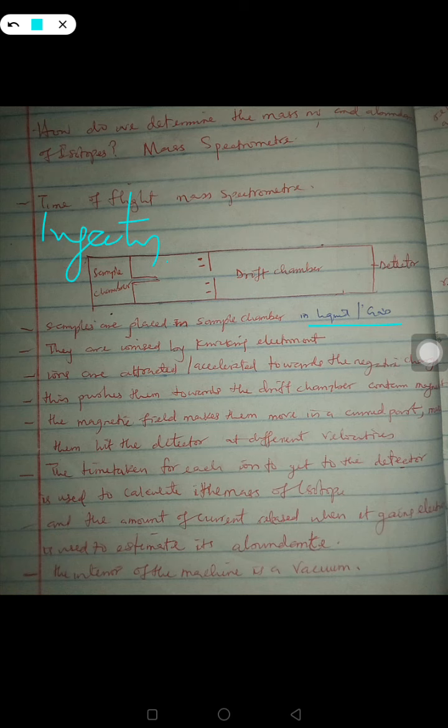Let me highlight that very well. If the sample you're putting there is gas, there is no need to do anything. If the sample is liquid, the liquid will be evaporated and turned to gas. So basically what moves from the sample chamber is actually gas.